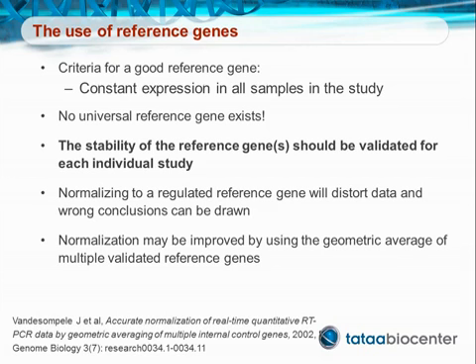It is also recommended to use more than one reference gene to improve the quality of the analysis, provided, of course, that all used reference genes are validated to be good reference genes for your setup.